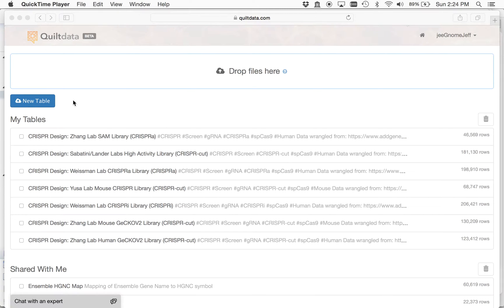Let's say I want to design a targeted CRISPR screen that's just focused on a few hundred genes that are important to me, as opposed to doing a whole genome-wide screen.